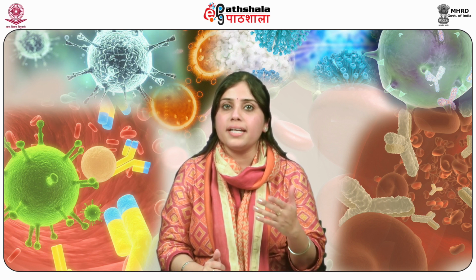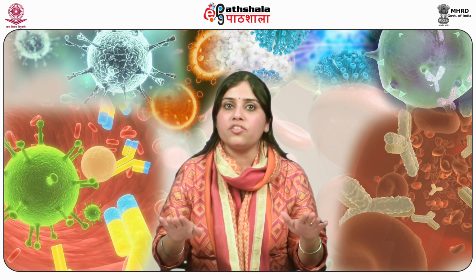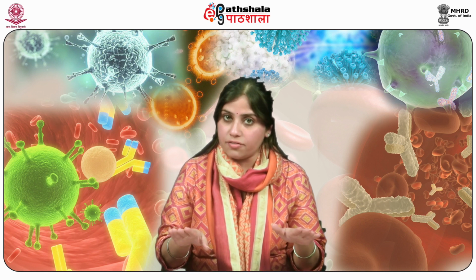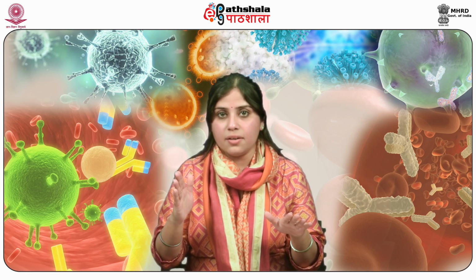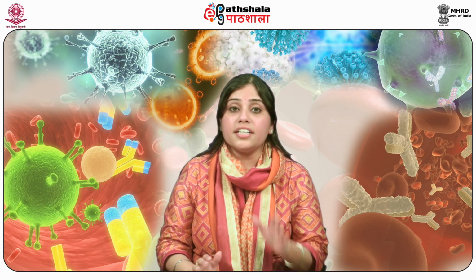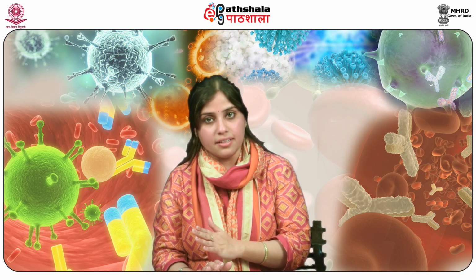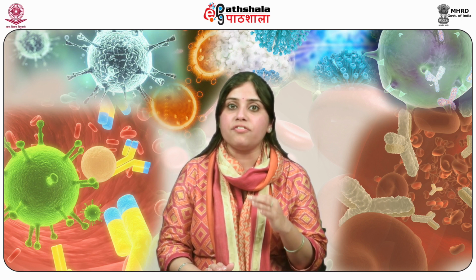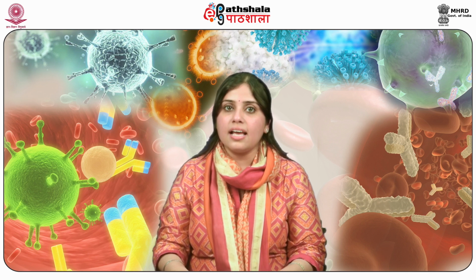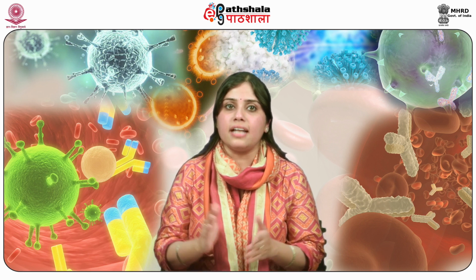SPR transducers operate by a prism coupling incident light onto an optical substrate coated with semi-transparent noble metals like gold. Total internal reflection occurs at this surface such that all of the light is reflected while none is refracted above a certain incidence angle. First, TIR should occur at the interface until the incident angle drops to the critical angle at which a fraction of the light is refracted across the interface. At the point of reflection at the interface, a standing wave would penetrate the exit medium to the order of 1/4 of the incident light wavelength.